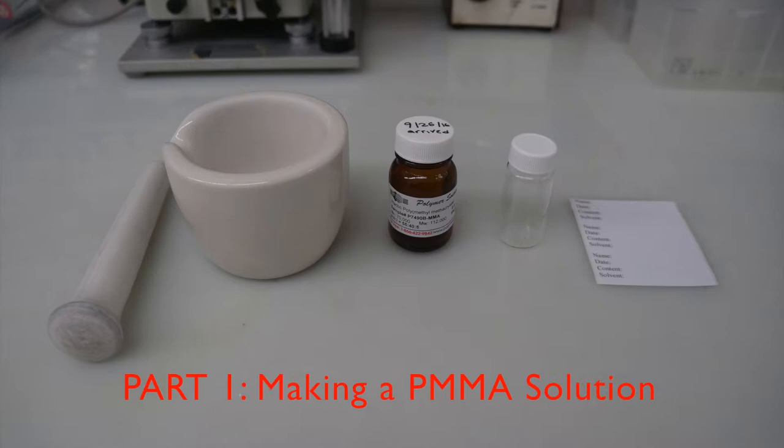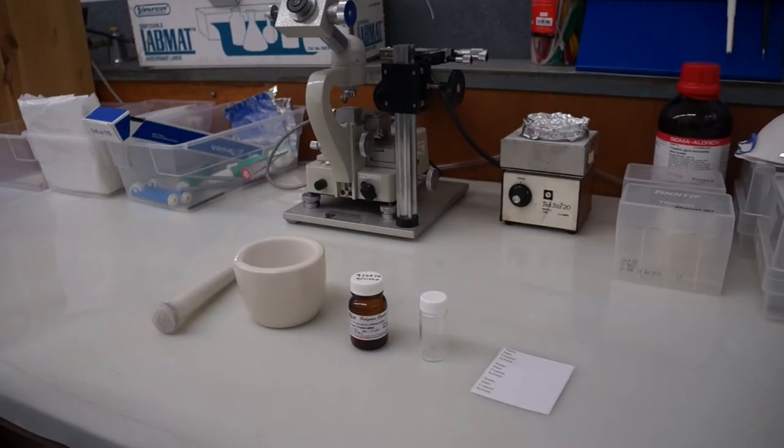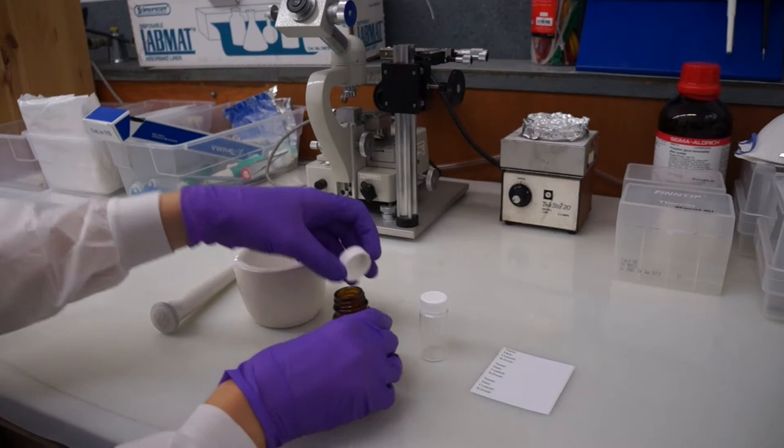Let's get started with the first part, making a PMMA solution. We're going to need to weigh out small amounts of PMMA and dissolve it. But since our stock often becomes one large piece, we'll need to break it up somehow. Here I use a mortar and pestle.